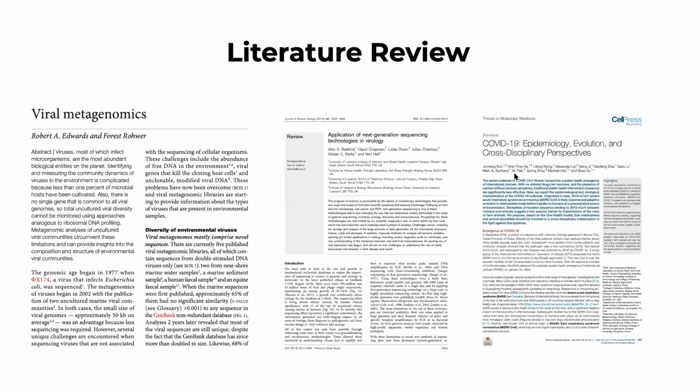And here we've prepared at least 3 different publications that are related to some of the questions that you have been posing here in the session. For example, there's a review on viral metagenomics, which kind of gives you a history of viral metagenomics. Application of next generation sequencing technologies in virology, again a review of how the different next generation sequencing technologies are used in virology.